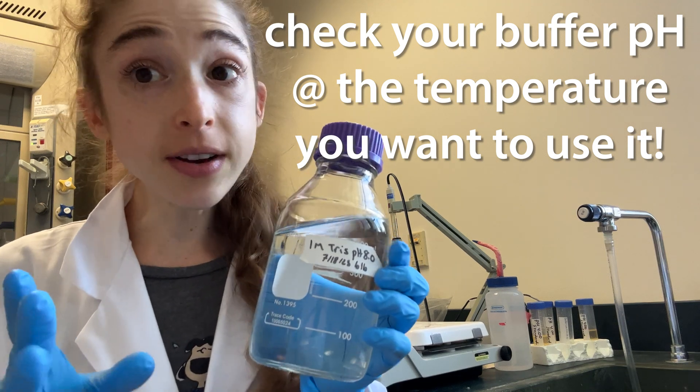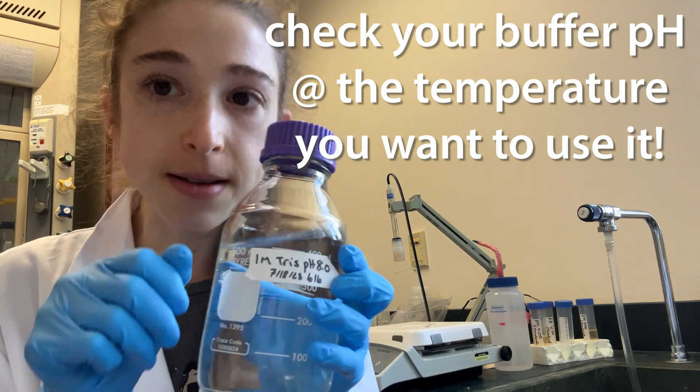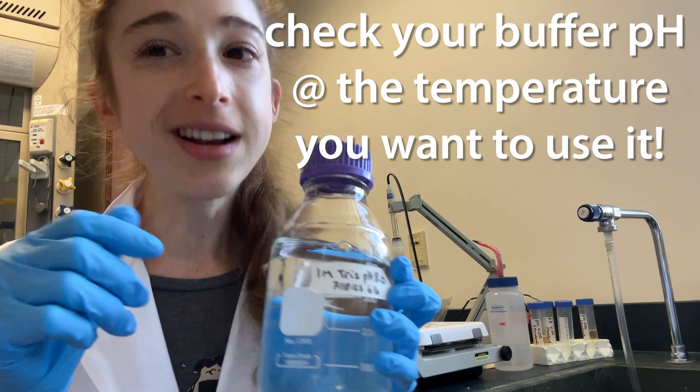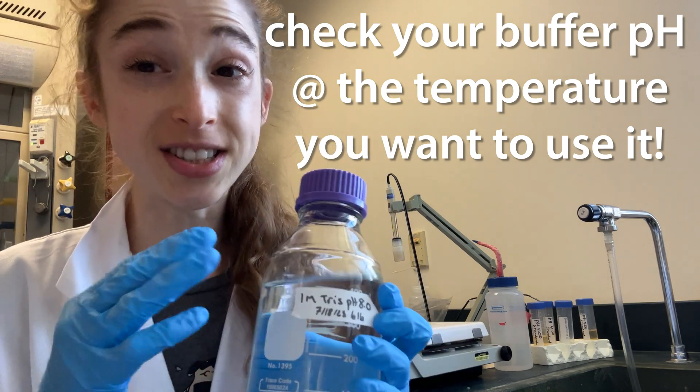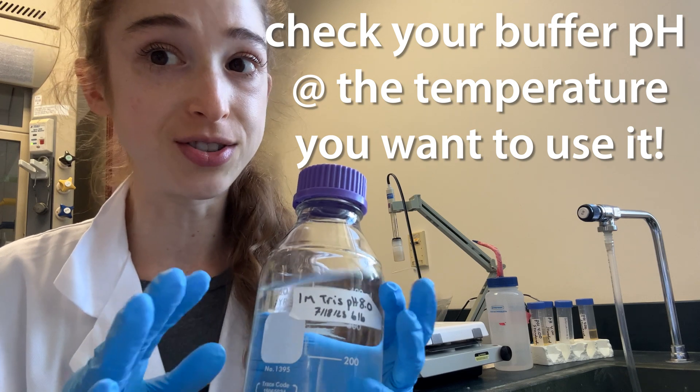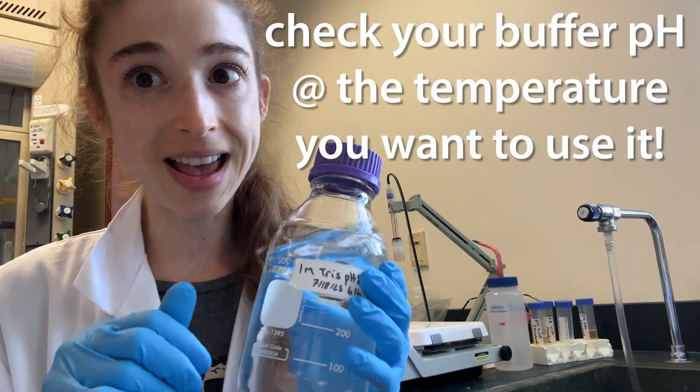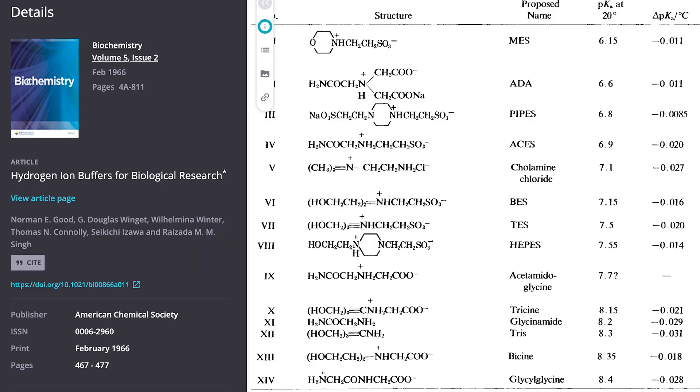Whenever you prepare a pH buffer, even if you calculated beforehand how much of the acid and base to mix using the Henderson-Hasselbalch equation to get to that perfect pH, you're still going to want to check the pH and adjust it as needed using a strong acid or a strong base. And you're going to want to check it at the temperature that you're going to be using it at, because the temperature can actually affect the pH.